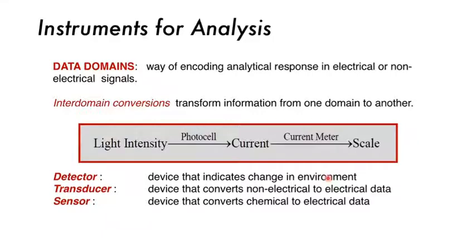So if it's in the path of the light and the wavelengths match up correctly, it will absorb the light. At which point, the amount of light, or the energy of the light that remains in our beam, will be changed at that wavelength, because some of it has been removed by the molecule. It's been absorbed. It's no longer as high energy. And so that change in energy is detected by the detector.